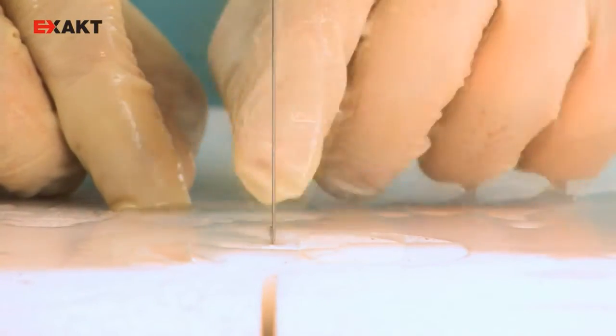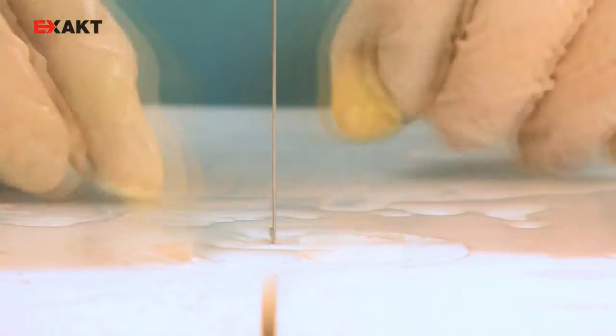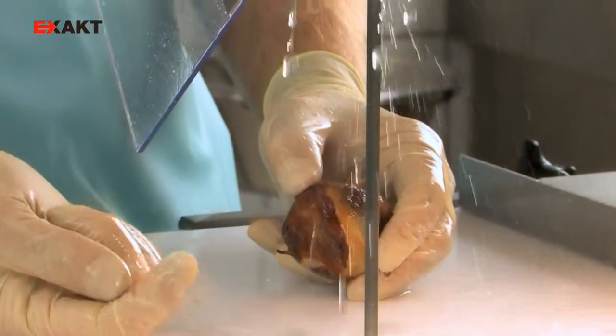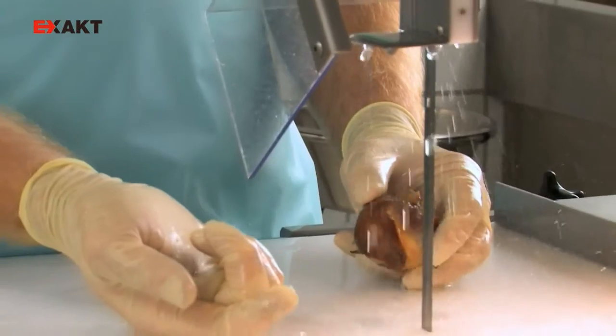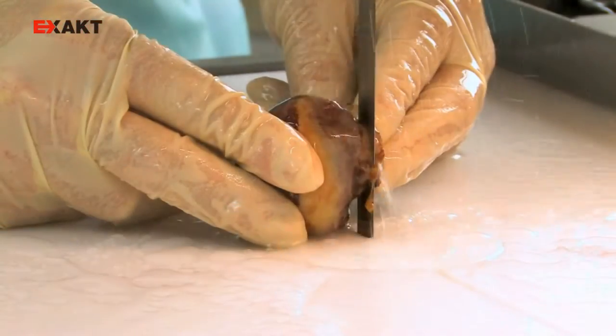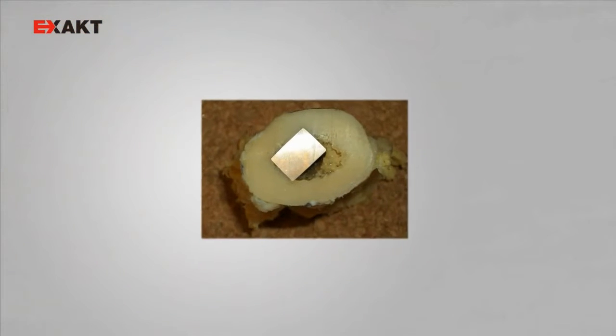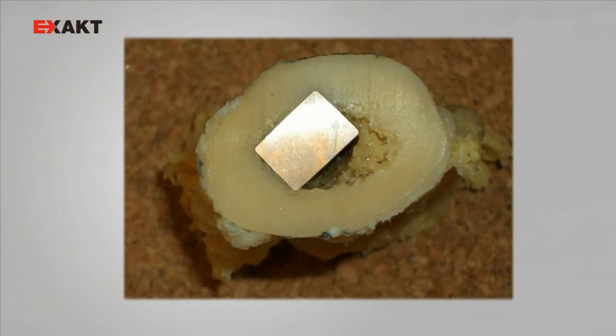I am thrilled with the low risk of injury presented by this saw. You can touch the blade without cutting your finger — you can even touch it without damaging your glove. The saw only begins to cut when you apply considerable pressure to it.